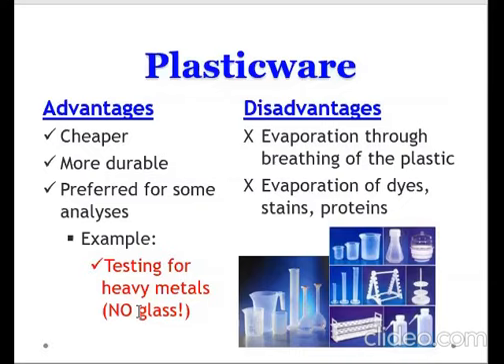So, another reason why glass also cannot be used is because some glass can absorb metal ions. Okay? They can absorb metal ions. That's why it is more preferable to use plastic, or if there's no plastic, disposable glass. Okay? So, those are the reasons.